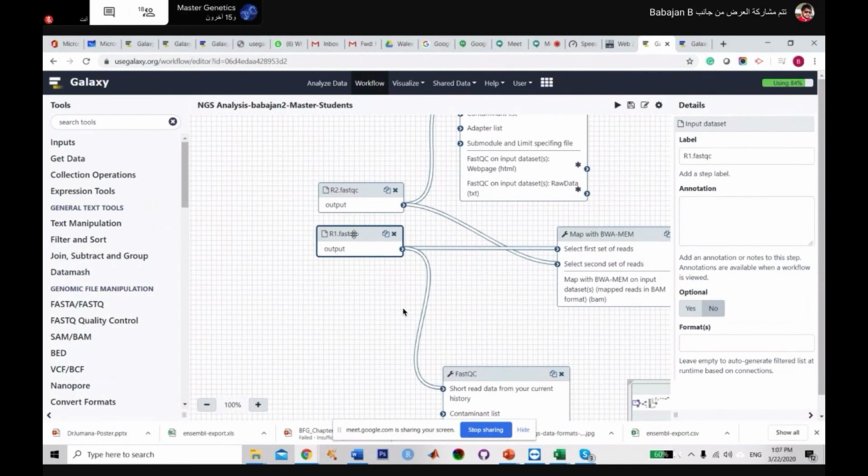For conversion of BCL to FastQ, we need specific software that works with Illumina. If the sequence is from Illumina, it needs the Illumina-based software, which they do not give free for academic use. It comes with the machine itself. Nowadays they are converting the BCL to FastQ themselves. So when we request the raw data, they finally give us the FastQ files, not the BCL format file. That's a good thing. From the FastQ, we can start our analysis.